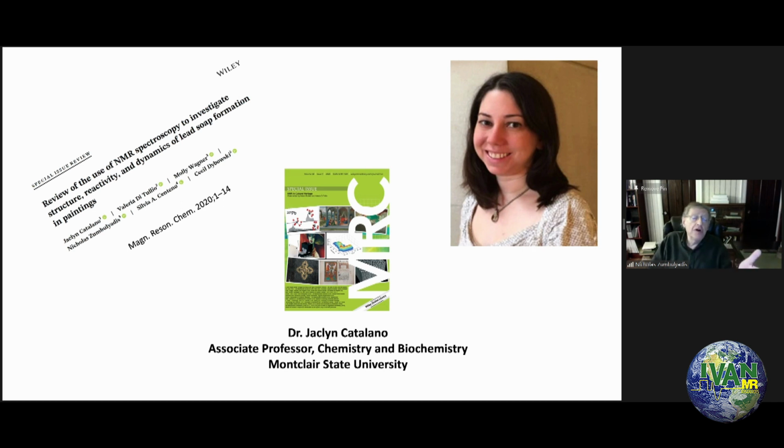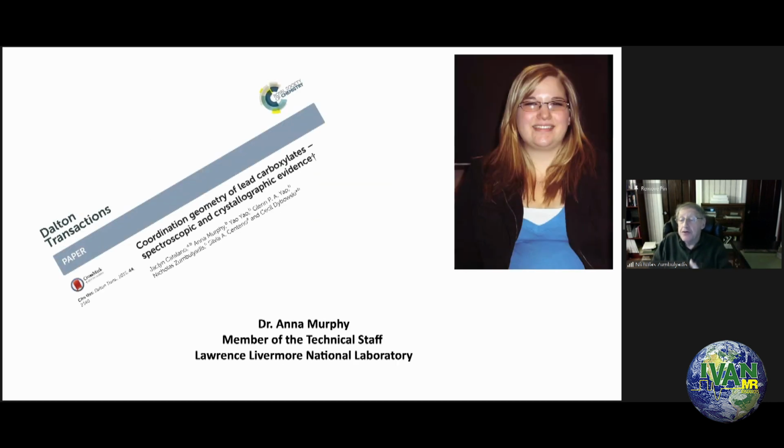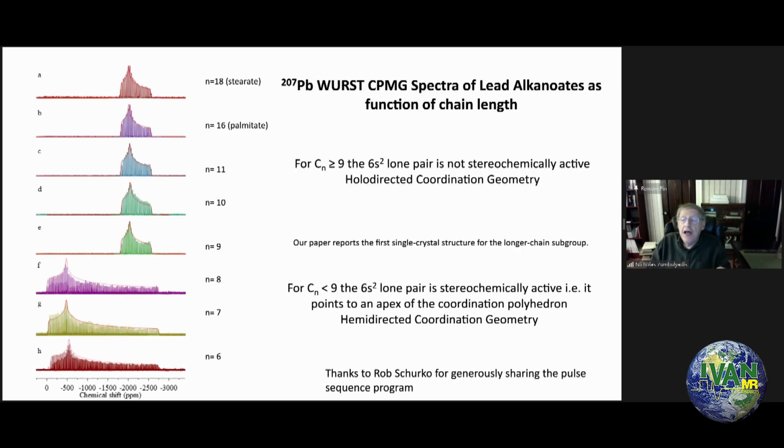She did the NMR work together with Anna Murphy, who was a graduate student in Cecil's lab, and Anna also graduated, and she is now a member of the technical staff at the Lawrence Livermore National Laboratory. And one of the important pieces of work that the two of them did was studying the coordination chemistry of a homologous series of lead carboxylates, and correlating it with crystallography. That paper was published in 2015, I believe, in Dalton Transactions, and here's the full reference if you're interested.